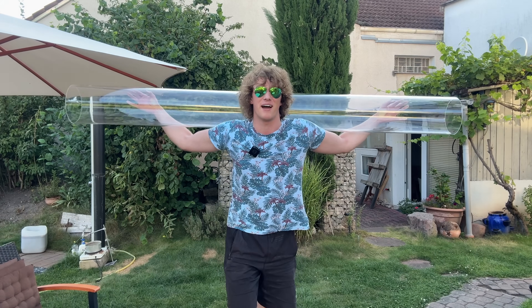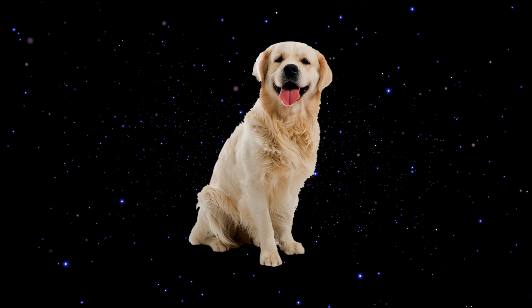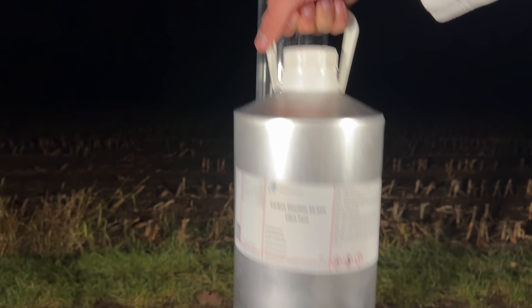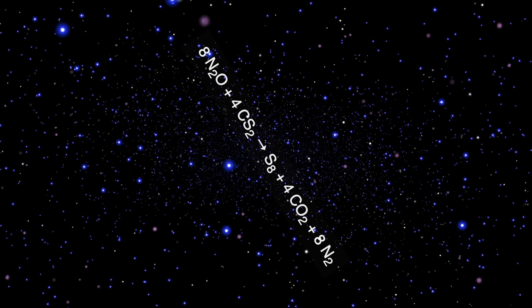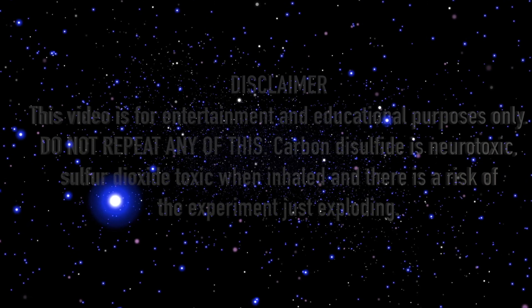To make it more interesting, I acquired this tiny piece of plastic pipe. But before beginning with the large-scale experiments, I should explain what the Barking Dog reaction even is. The Barking Dog reaction uses an oxidizing gas, which is nitrous oxide, and this reacts with carbon disulfide vapors. The laughing gas reacts with the carbon disulfide to form elemental sulfur, carbon dioxide, and nitrogen. As a side product, toxic sulfur dioxide is formed, which is why you should not try this at home.